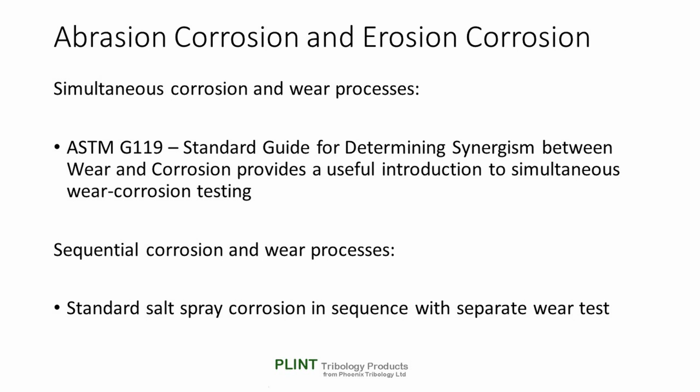The term tribo implies two bodies in contact and mechanical work at the surfaces. Hence, a tribo contact in a corrosion environment combines the effects of both mechanical and chemical wear. This is usually greater than either mechanical wear in a non-corrosive atmosphere or chemical wear in the absence of work of friction. Tribo corrosion occurs when a component is subjected simultaneously to mechanical wear and corrosion. For mechanisms that operate for long periods in a corrosive environment, it makes sense to perform tribo corrosion experiments.